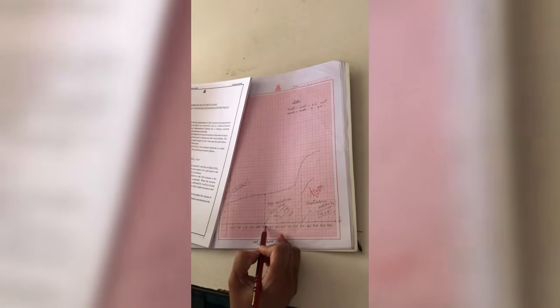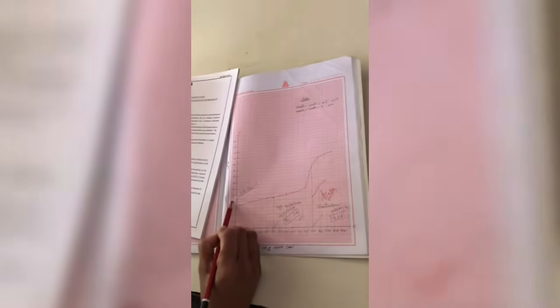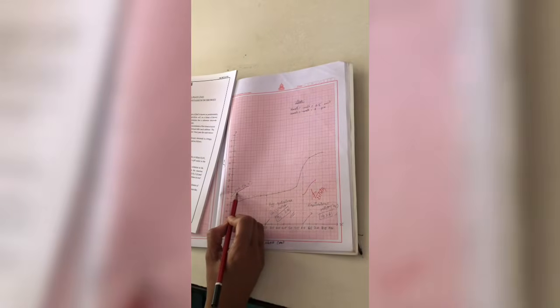Please follow this carefully, read the viva questions, you will understand better, listen to the video, and you can understand further. When you come to the lab, if you have any further doubts, I will clarify them and we will do the experiment in the lab. Meanwhile, record all these things, do the calculation part, plot the graphs, find the equivalence point, find the half equivalence point and measure the pH at the half equivalence point. That is nothing but the pKa value of the given weak acid. So this is the first experiment in your instrumentation experiments, the determination of pKa value of a weak acid using a pH meter.